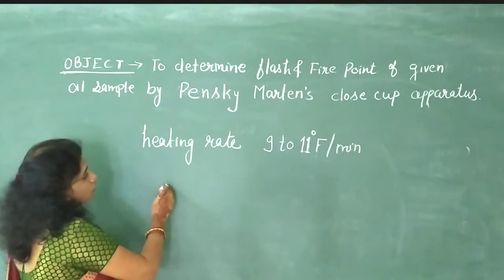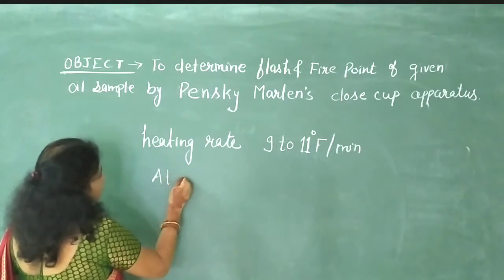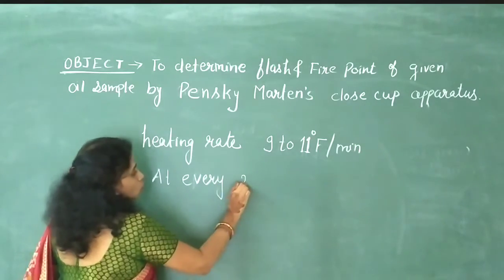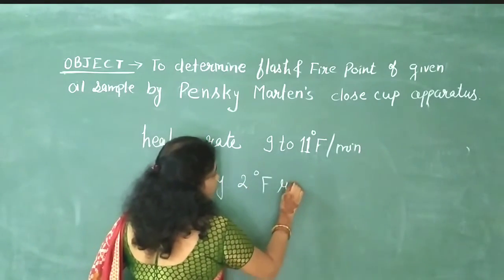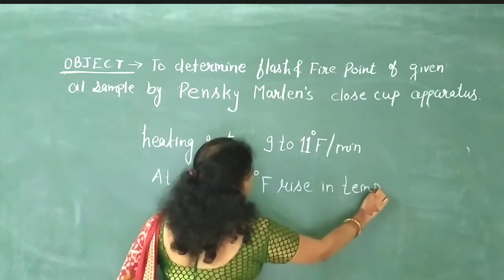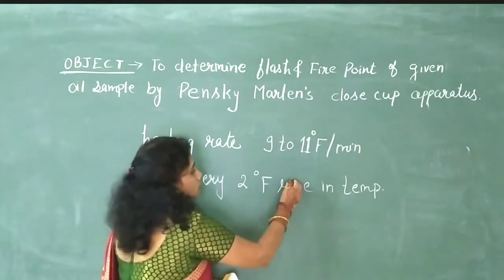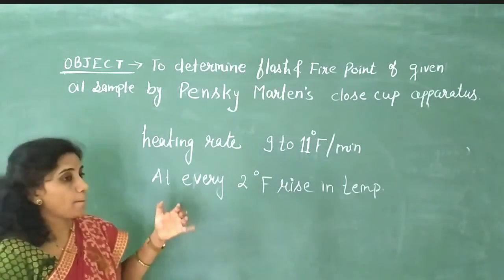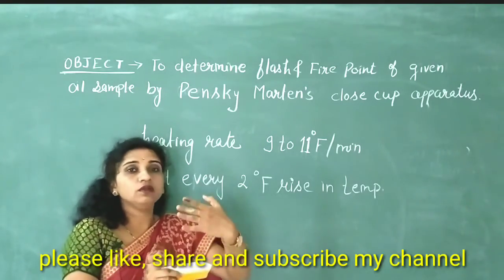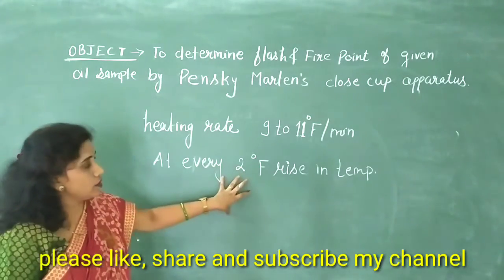One thing should be remembered: at every 2 degree Fahrenheit rise in temperature, we should apply the test flame over the oil vapor. So we can get a good result by this interval.